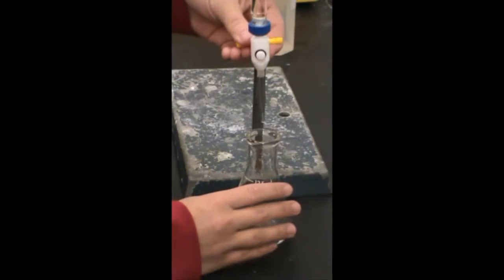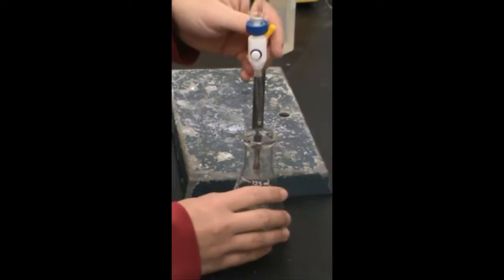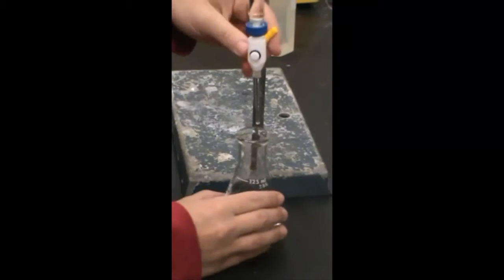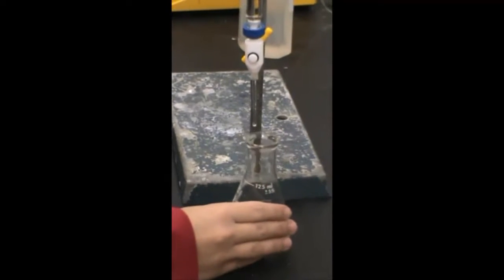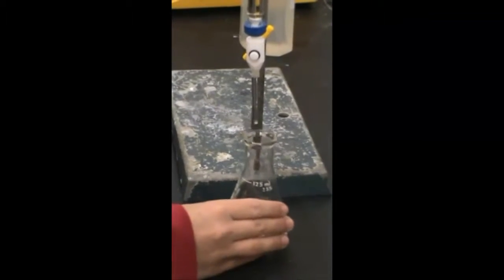The technique for adding the sodium hydroxide is you need to open up the burette to a steady drip with one hand and, using the other hand, swirl the liquid in the flask. Swirl the flask on the counter to prevent dropping it. As you get closer to a pH of 7, the liquid in the flask will remain pink longer but will disappear with stirring. For Part B, you will be studying buffers.